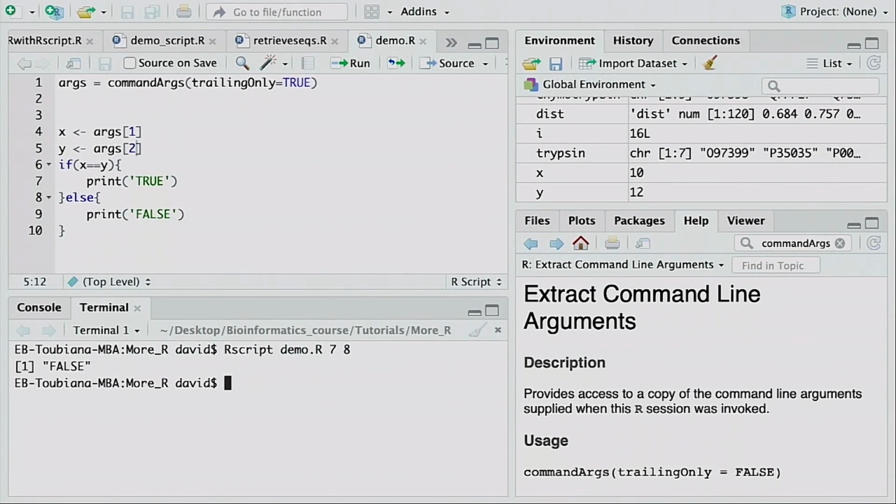So before you can actually execute the file from shell, you need to save the file first. As long as you only have it in the editor of RStudio, the computer doesn't know it exists. It exists on screen, but not in memory. So in order to execute it, you need to make a file called demo.r. I want to show you, you can make more than one statement in one if.